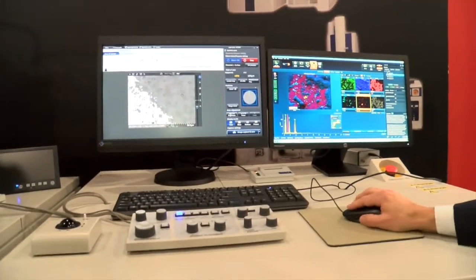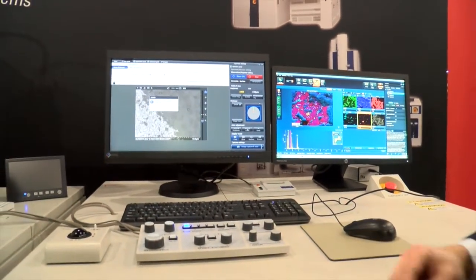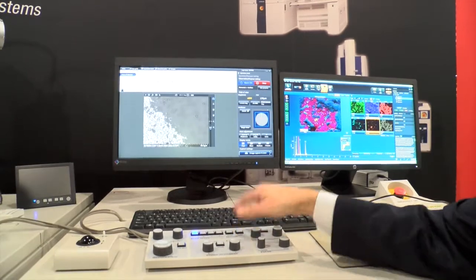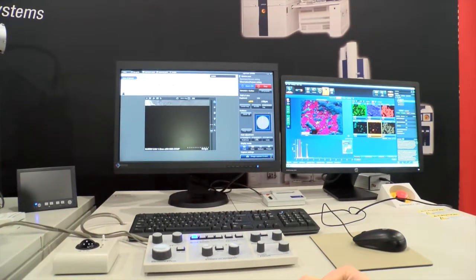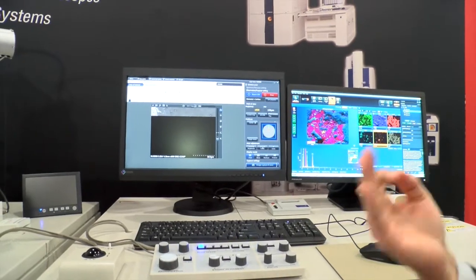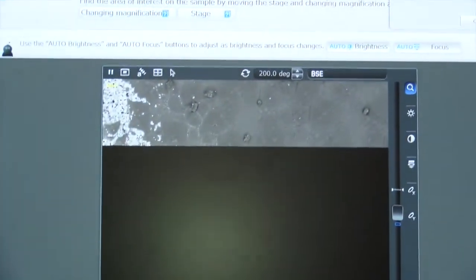The operator is really only left to select auto brightness and contrast, autofocus, and capture an image that's already focused, astigmatism corrected, brightness and contrast corrected — a perfect image — three clicks of the mouse and you're finished. Job done.